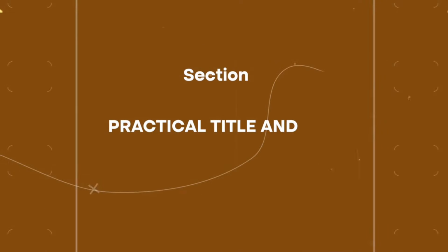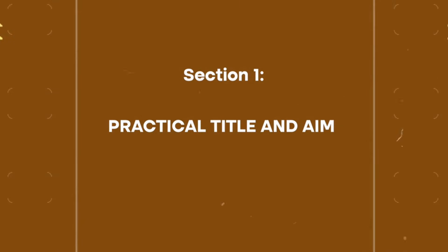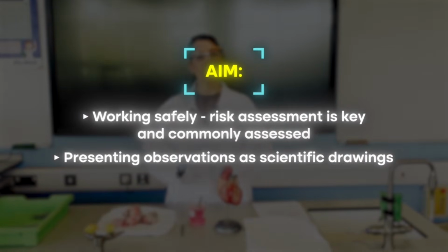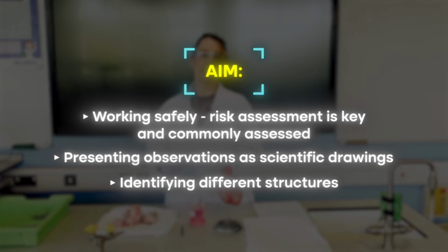So for the students, one of the key focuses of this practical when it gets to the exams is knowing how to work safely, how to do scientific drawings of their results, and being able to identify the structures that they actually learn in lesson.